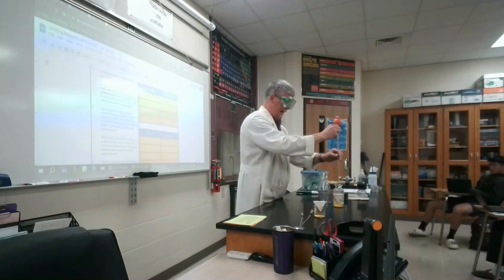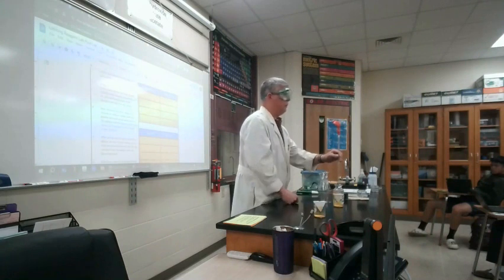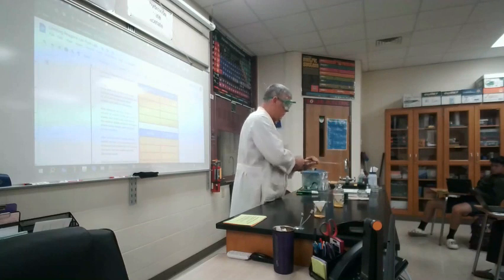Do not pull the solution up so far that it gets in this bulb. Do not do that. By the way, if you're pressing this button here and it will not go up anymore, re-squeeze the top bulb. You probably put all the air back into it. Okay? Questions?